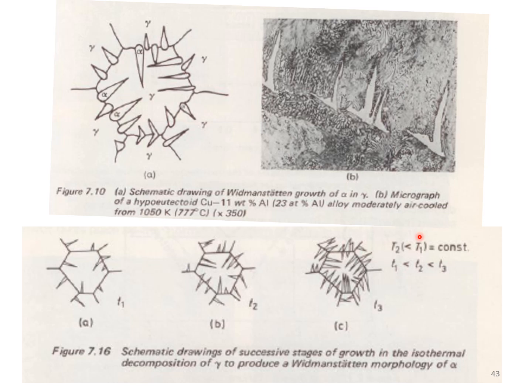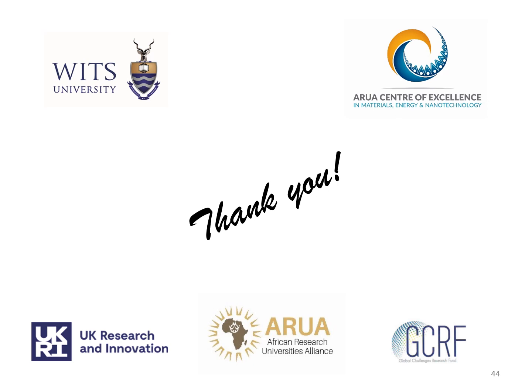The second is that there's lots of nice space at the grain boundary to form the phase. And the third is the grain boundary, because there's lots of nice space, because there's two different crystal structures coming together, the grain boundary can act as a diffusion highway, because diffusion is easier there. So this just goes through in time, and you can see more of it coming in. Thank you very much.